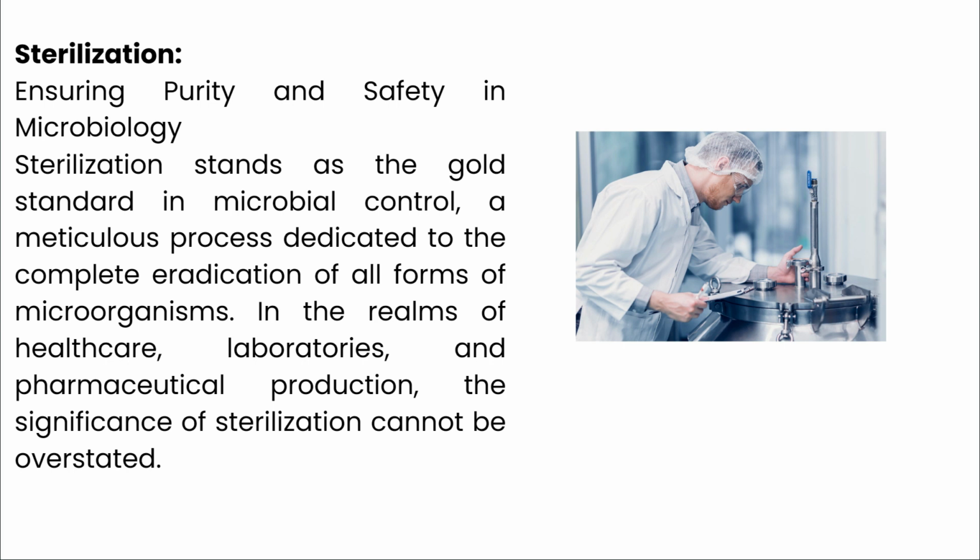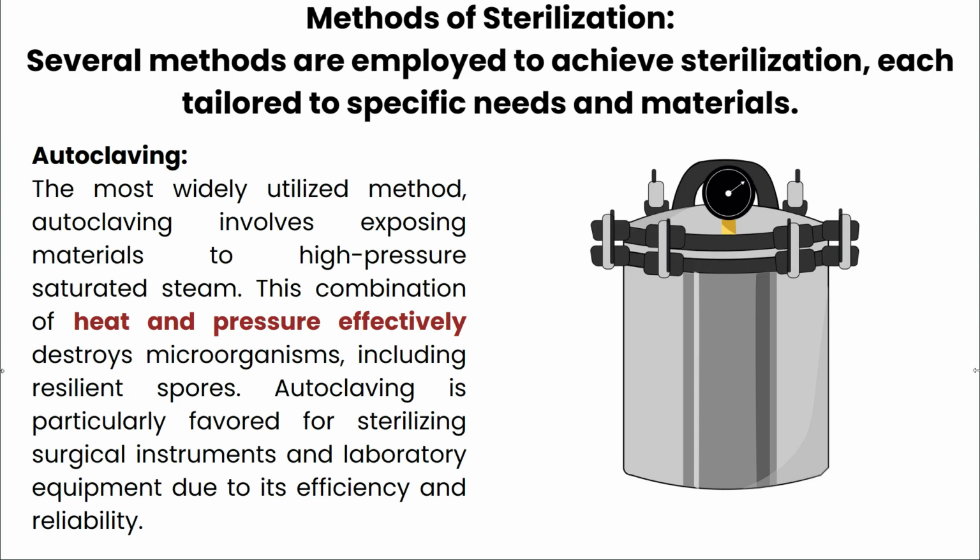industrial processes. There are different means of sterilization. You can sterilize the glasswares that you use to culture microorganisms, or you can sterilize the media to grow microorganisms. There are different techniques depending upon the type of component that you are looking to sterilize.